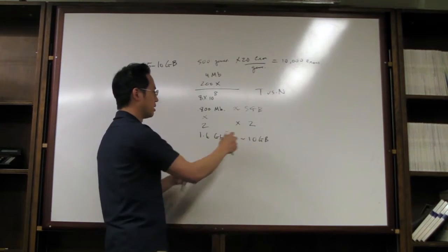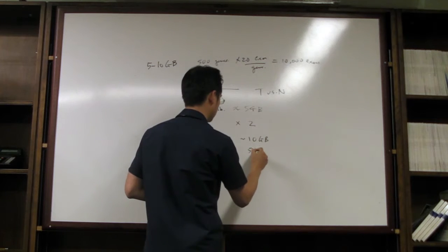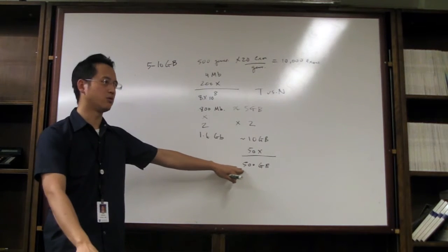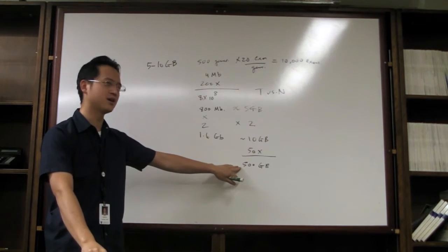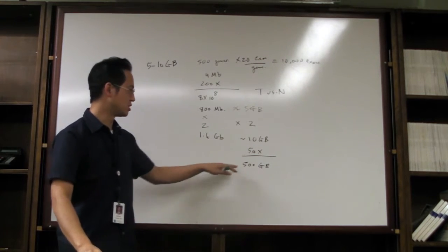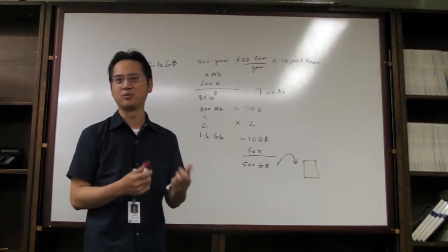So this is what you're going to get back. And with this amount of data, just to quickly go into the informatics a bit, if you did, say, 50 samples, you're looking at about 500 gigabytes of data. That's a lot of data. If you're sitting at home on your Verizon FiOS, right, or Comcast, Xfinity, and you try to download this amount, I think it would take you a good week or two. So the best option to receive this data is to package it into an external hard drive, and they just ship it to you by FedEx. That's what most people do nowadays.